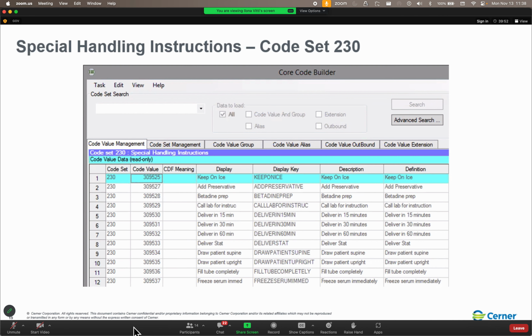Now, folks, I want to point out, especially for my folks from last week from Micro, this copy button behaves differently than the one in Micro. Remember, the one in Micro copies the same collection requirements from one specimen type to multiple other specimen types for the same order. But over here in GenLab, it is all the collection requirements from one order to one or more other orders.